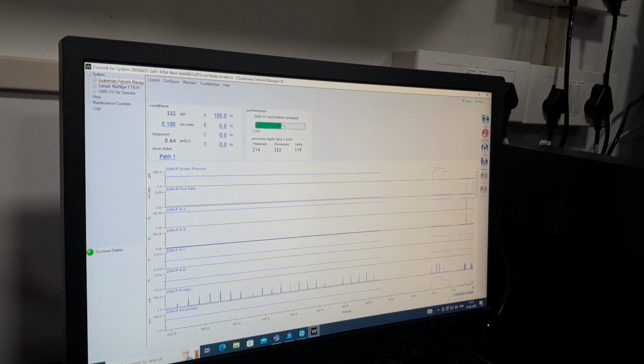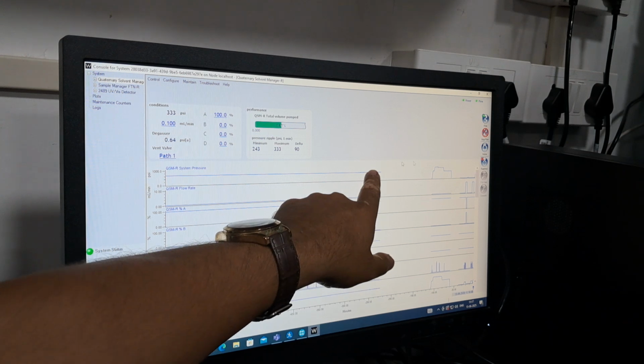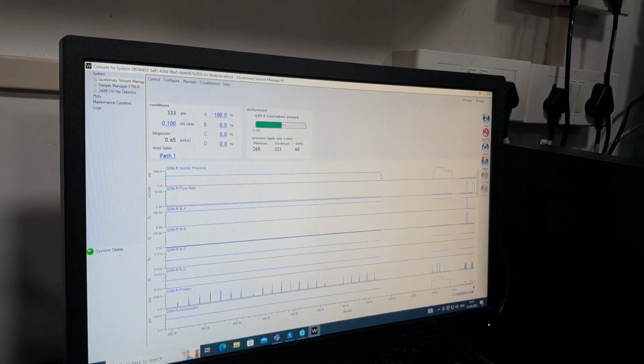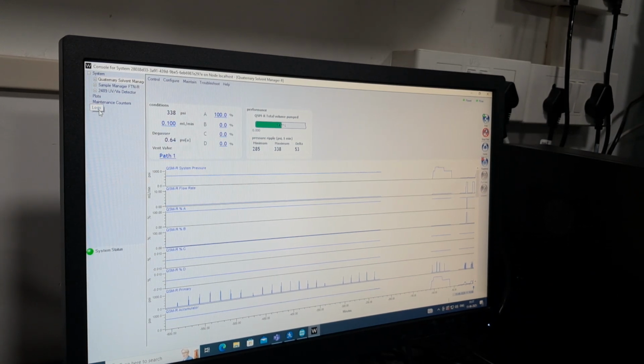That is the thing. What was the change therein? Was it that the solvent finished or something? No, solvent was there actually. It went for a communication failure, maybe due to power loss or something. Maybe the UPS. You can check the UPS capacity, how much storage it can hold. That is one of the reasons.